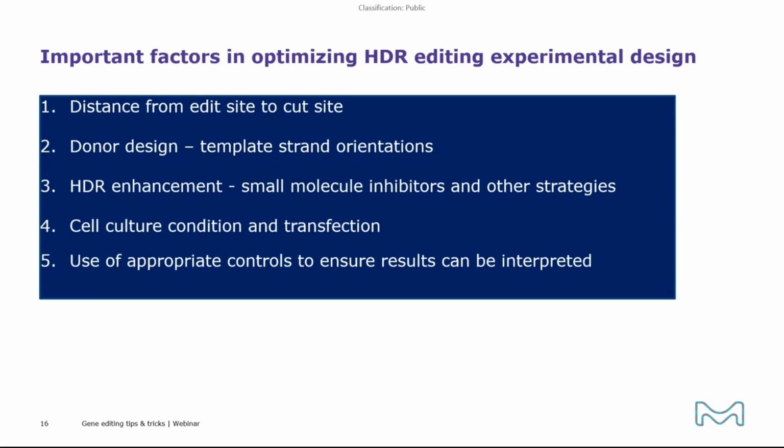And besides the cut site to edit site distance, donor design, HDR enhancement strategy, cell culture condition, and appropriate controls also need to be carefully planned. And for controls, we recommend at a minimum using a donor-only transfection control to ensure results can be interpreted.